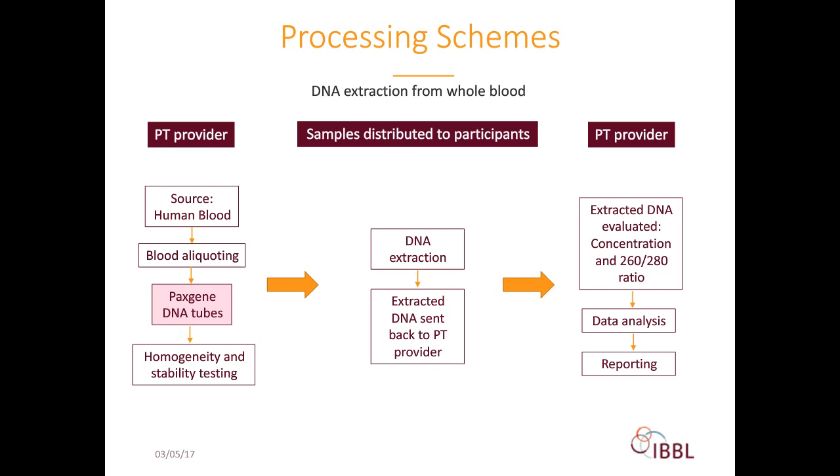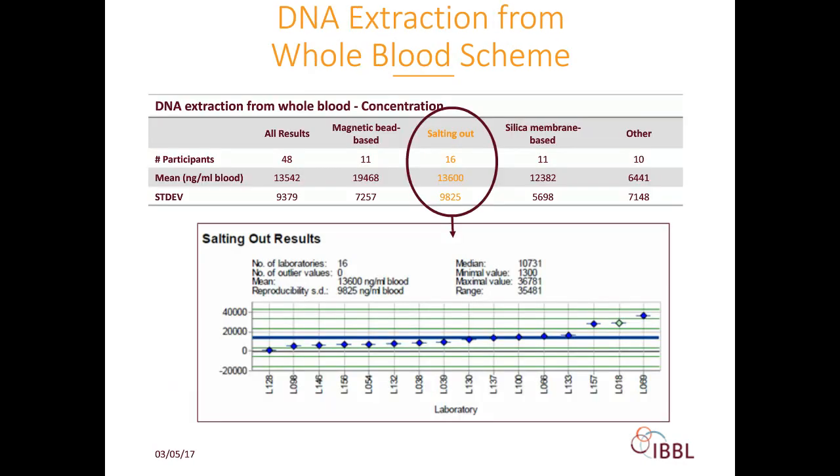And here is an example of such a report from a PT, proficiency testing program for a processing method, which is DNA extraction from whole blood.